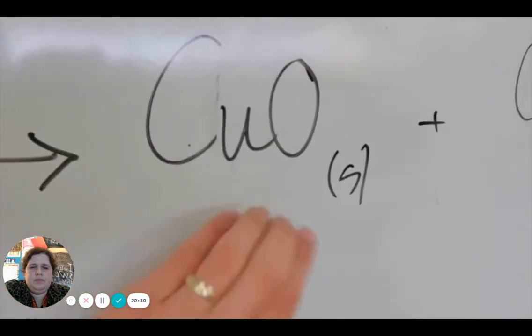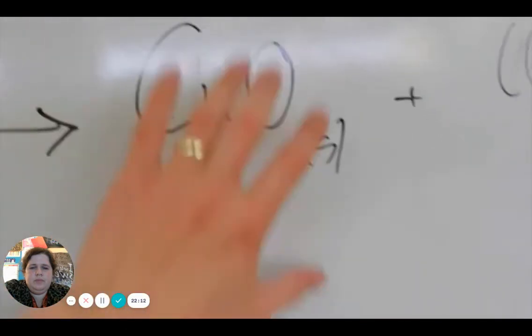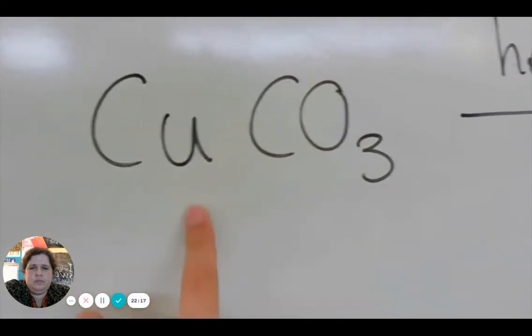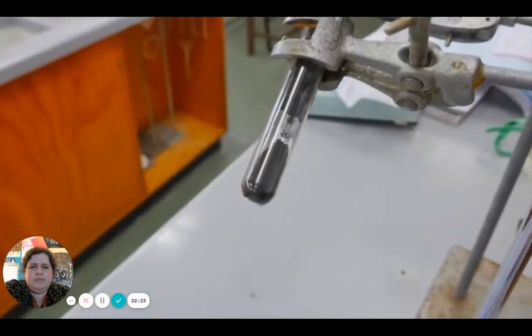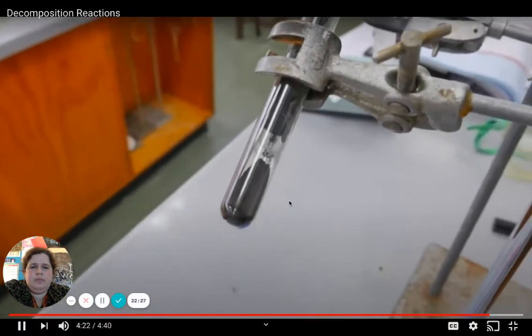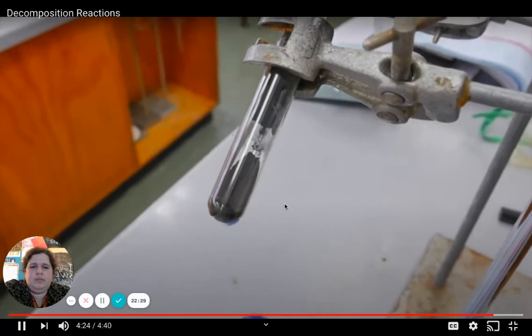The rest is probably good in whatever you got left over. So if I've used my carbon, I've used some oxygens, what's left over? I've still got the copper. It's got to be somewhere. It hasn't turned, from what I can observe, into a coppery color like metal, so it hasn't completely decomposed down to its component elements.